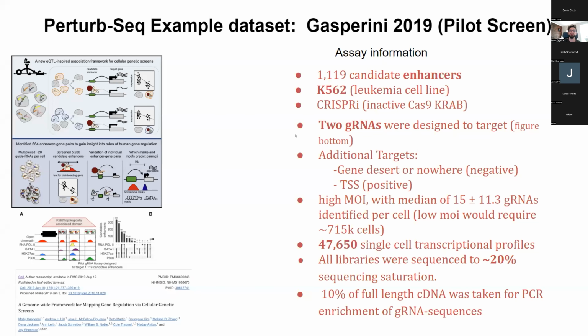It will be a short presentation. We talked a lot about Perturb-Seq last week and about the tools that we have available. We don't actually have end-to-end pipelines to solve this problem. There are so many variants of these techniques, and we need to find how to assemble pipelines for them.